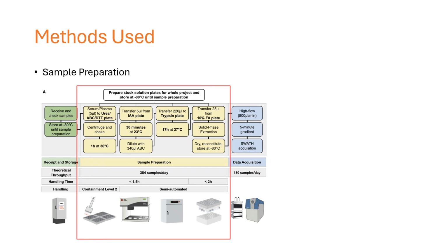All right, moving on to sample preparation. Again, in the previous step, they had prepared stock solutions so they can use them throughout. And here you can see where they're plugged in at various stages of their preparation.